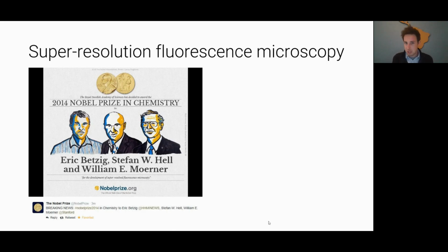And again, a topic for another time, but really one of the most exciting developments in microscopy over the past 20 or 30 years, and what won the Nobel Prize almost a decade ago, is what we call super resolution fluorescence microscopy. These are techniques that now break this diffraction barrier of light, where up to a certain point you can't get any better detail, you can't improve the resolution. These scientists and others have come up with techniques to enable us to break that diffraction limit. And we're very lucky here in South Africa in particular, we have many super resolution instruments that are able to exploit these techniques in order to generate really unprecedented insights into cells.